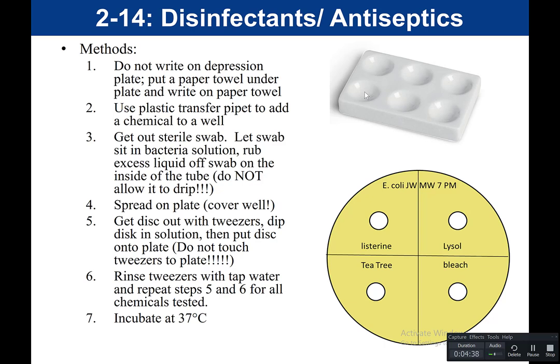Once you get your chemicals in all your wells, get out your sterile swab and dip it in the bacterial solution. For this plate, it would be E. coli. Dip the swab in the E. coli tube and rub the excess liquid off on the inside of the tube — you don't want the swab dripping wet because it will leak bacteria during transfer. Then take that swab covered in bacteria and swab your plate to make a lawn, covering the entire plate completely with bacteria.